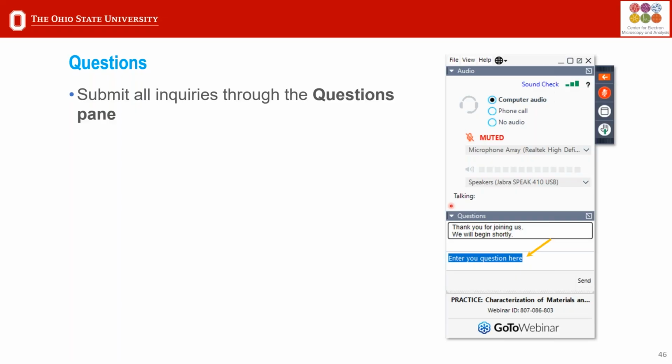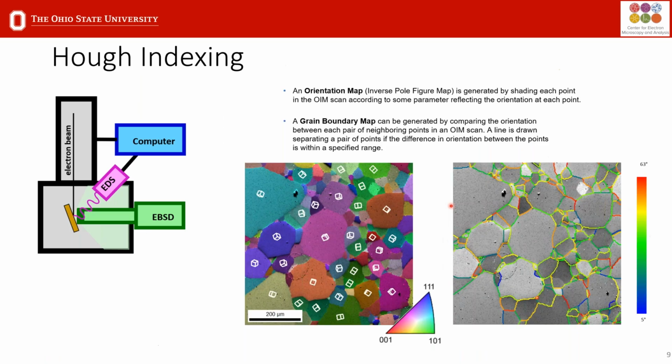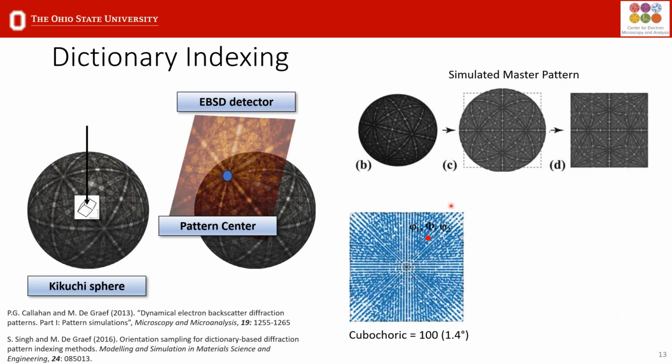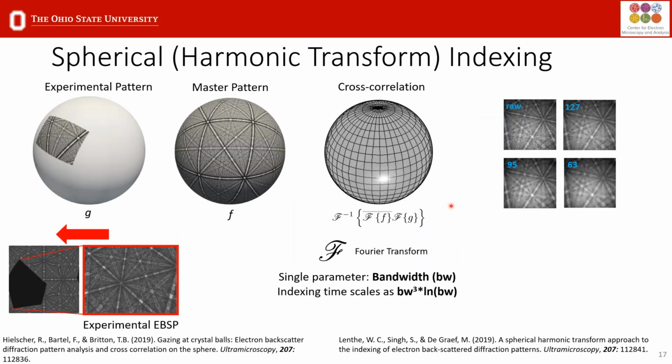Yeah, so based on literature and also experiments, if I can go all the way back to this slide. If you take your raw pattern, that is all the information that's contained within the material.